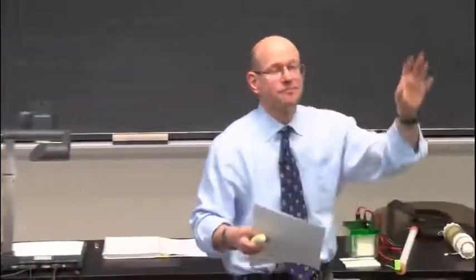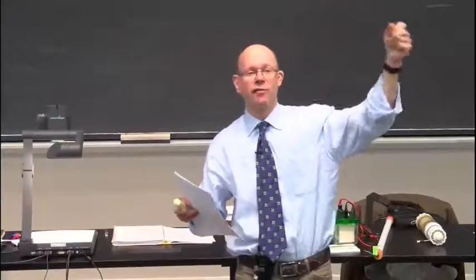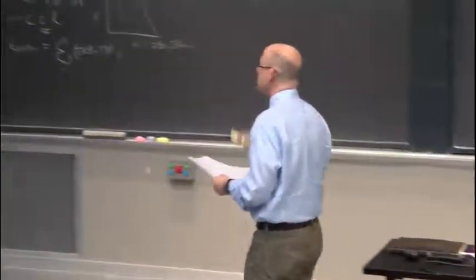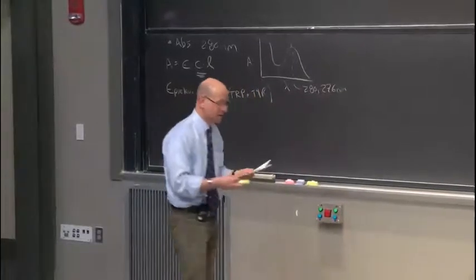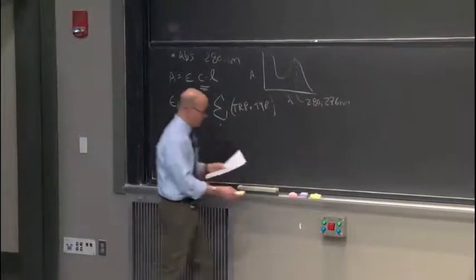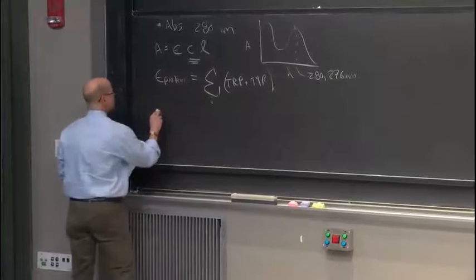But at the beginning, when I've just lysed my cells, there's a lot of DNA and RNA there, and they're going to absorb at 260 nanometers, and that's going to make it really complicated. And so clearly, although this is a great way later on, it's not such a good technique at the beginning. So I need some other techniques. And so some other techniques include dye binding assays.